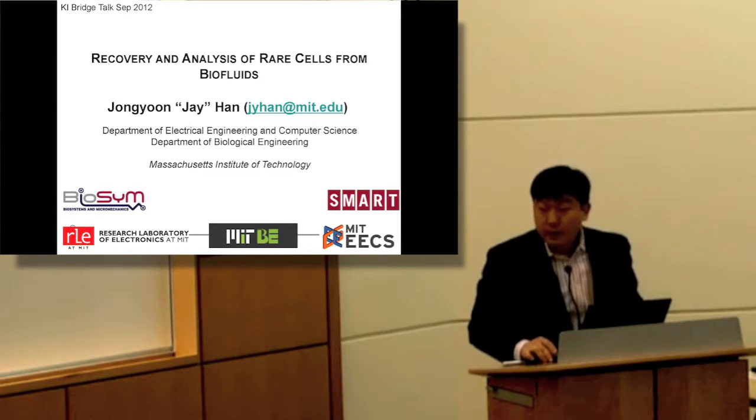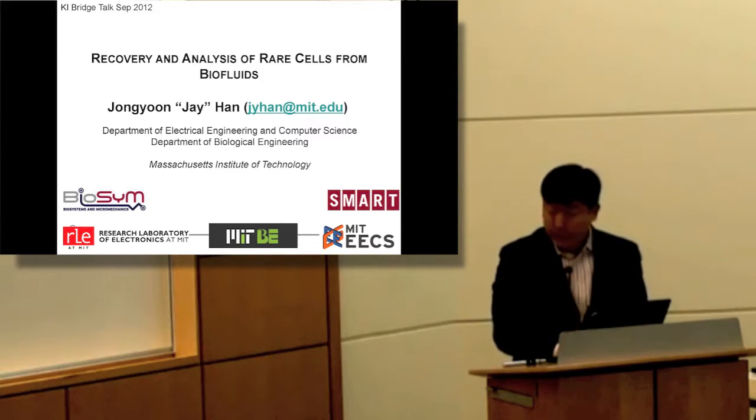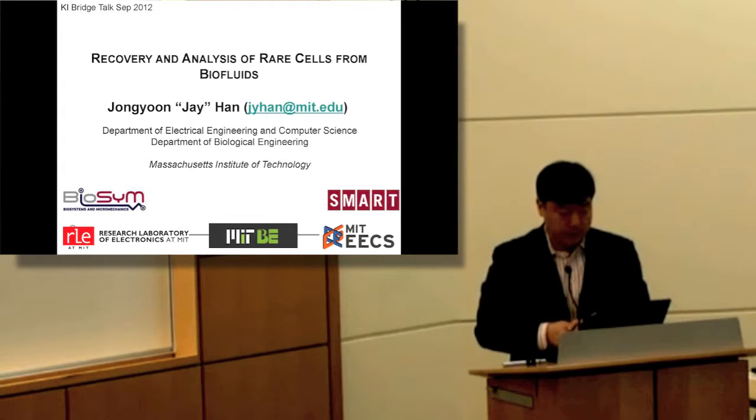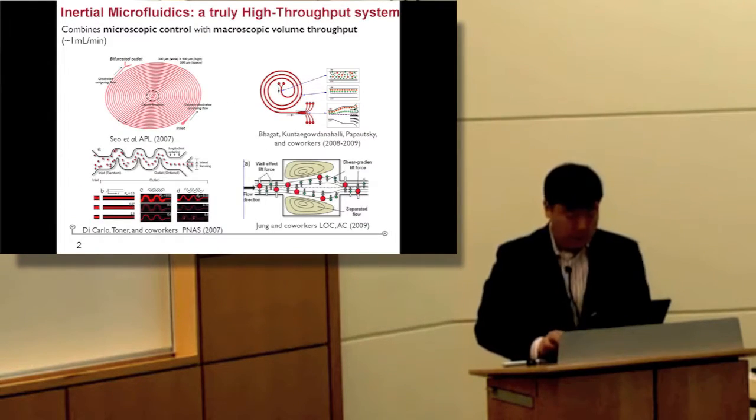Okay. Good evening, everyone. My name is Jongyoon Han from MIT Electrical and Bioengineering. Today, I'm going to talk about some of the microfluidic effort on separating rare cells from various kinds of biofluid.